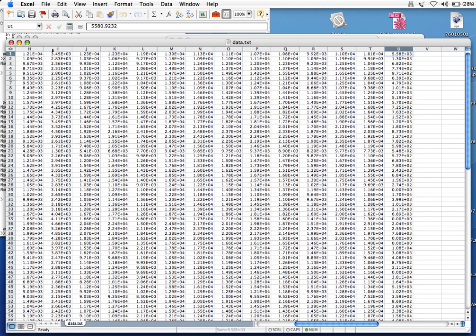So this is the raw data, and you definitely want to save this. And if you want to make plots of data, this is a good place to start. However, in the next section, I'll also show you how you can normalize this data in SAFA right away.